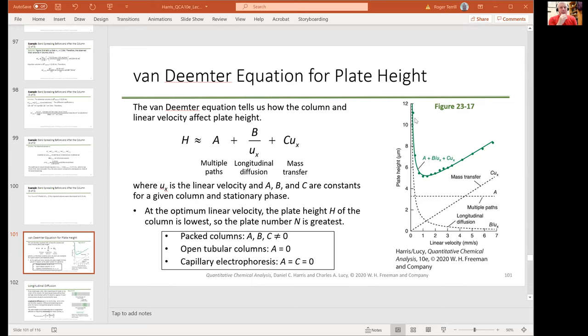So Gianluca, I'm just joking around here, basically, but I'm not joking, right? Because when you talk about molecular size, everything is gosh darn small, right? Everything is super small. And then another thing that we're talking about here is binding: the strength of the binding, or the strength of the partitioning, or the strength of the adsorption, or the strength of the ion affinity, or the strength of the other affinity. And what you've mixed into this thing is the idea of size, which really only belongs in size exclusion, right? And the metaphor is really different for size exclusion, right? And I don't want to talk about size exclusion right now.